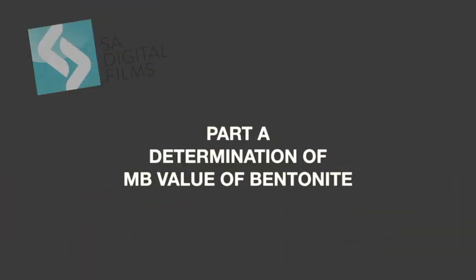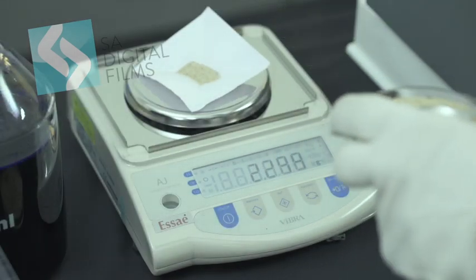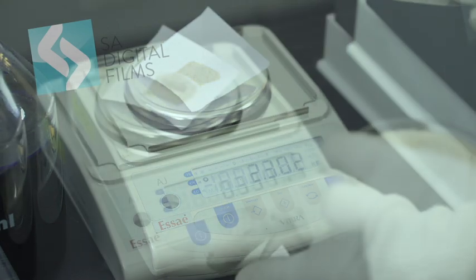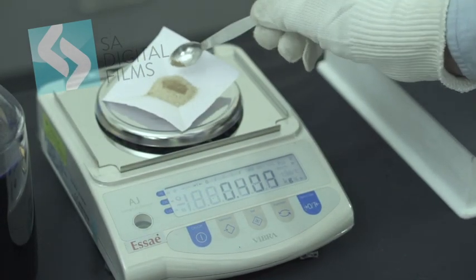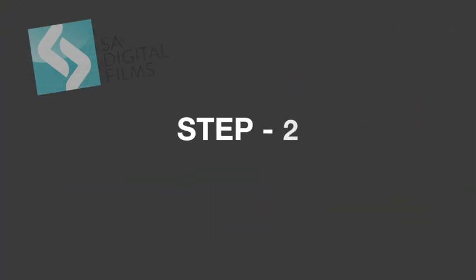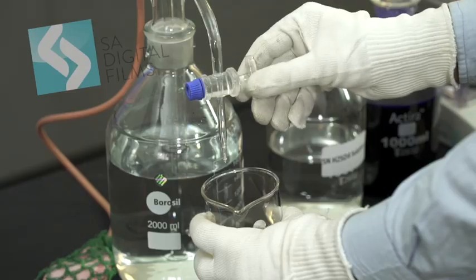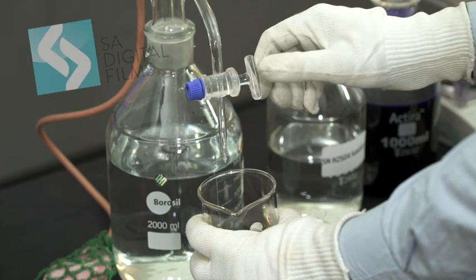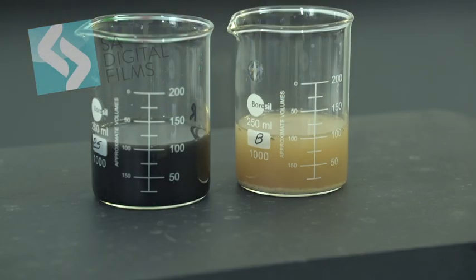Part A, to determine methylene blue value of bentonite. Step 1. Weigh accurately 4.5 gram of washed silica sand along with 0.5 gram sample previously dried at 105 ± 5 degrees Celsius. Step 2. Add the sample to 50 ml distilled water and 50 ml of 2% tetrasodium pyrophosphate solution. Gently boil for 10 minutes.